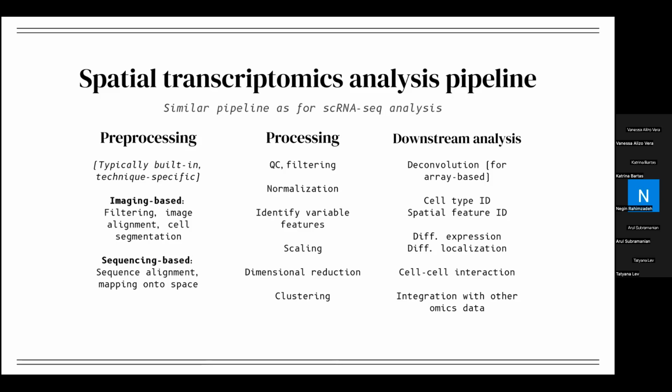And this is a big challenge. It's difficult to do. And then for sequencing-based technologies, you want to align your sequences and then map those sequences back onto space. So that's the pre-processing stage. Thankfully, we don't usually have to worry about this. This is all done by the computer.